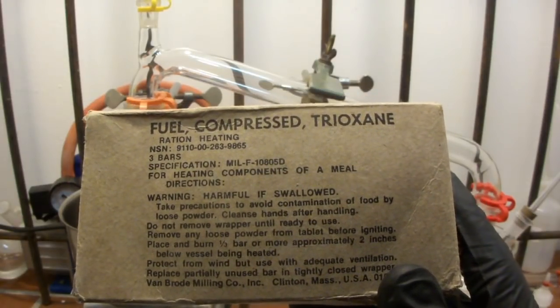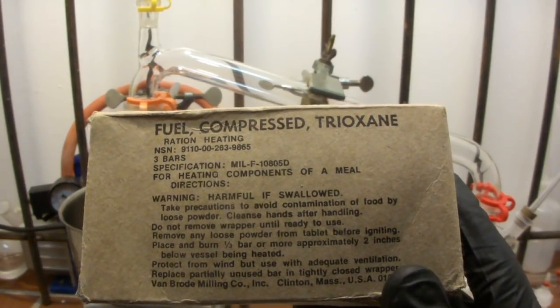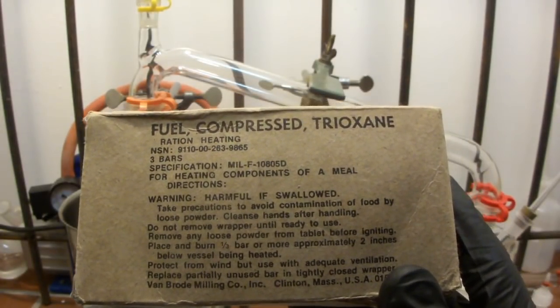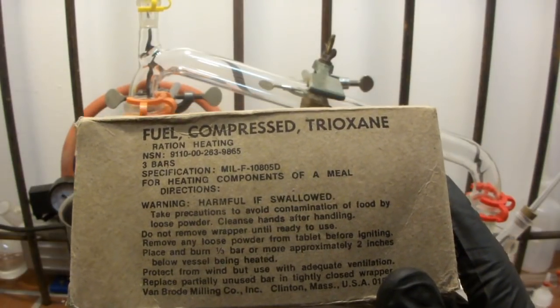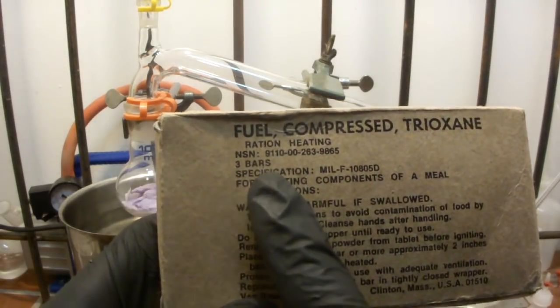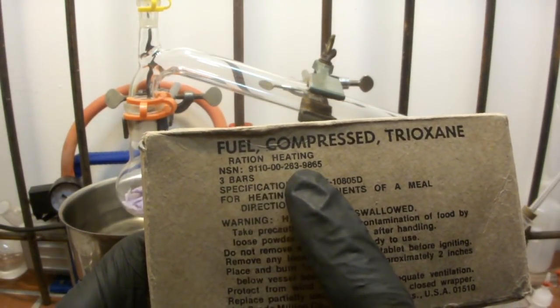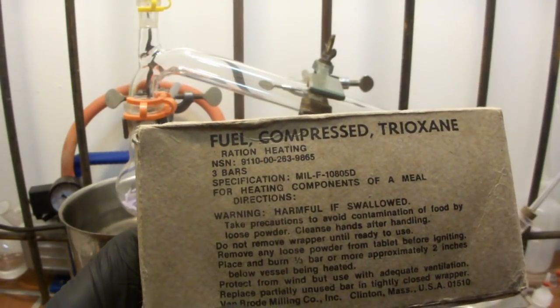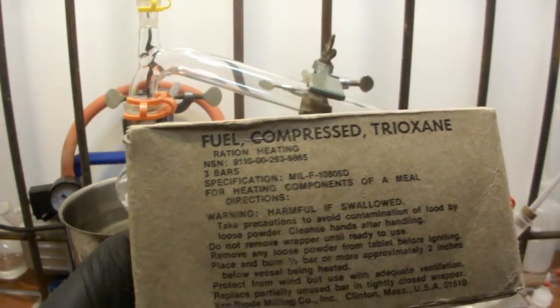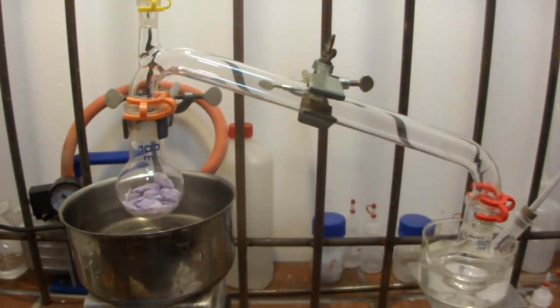So if you have seen our last videos in which we talked about separation problems, you know that the first step would be to look up what the contaminants would be in this fuel bar. So here you can see the national stock number, and under the number and also under the specification sheet you can just look up the components.